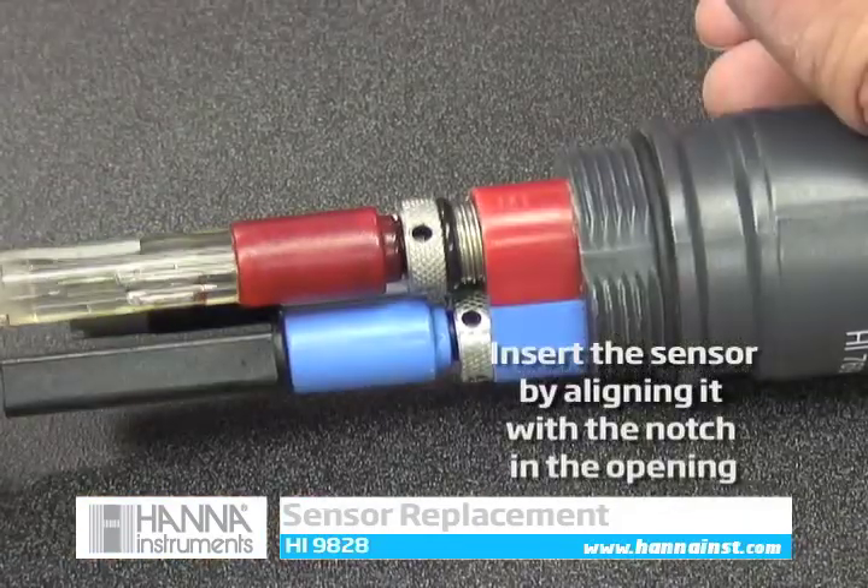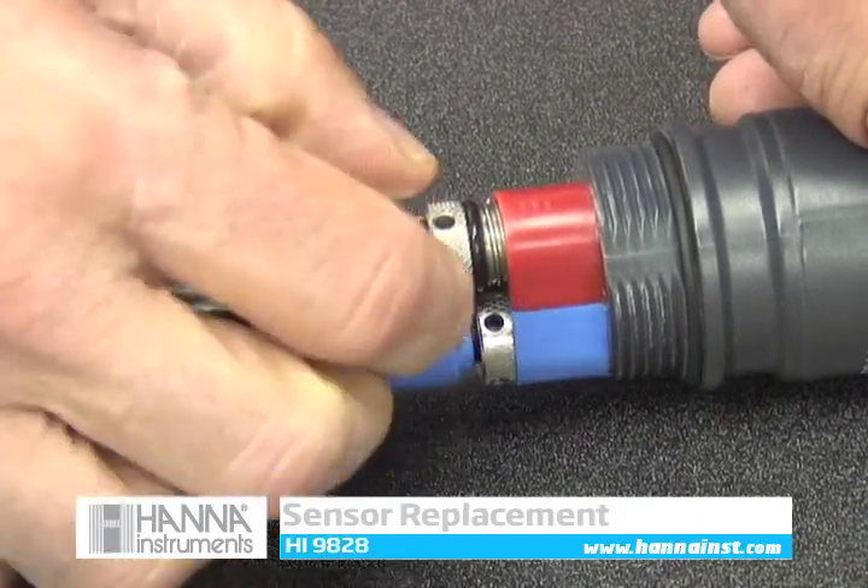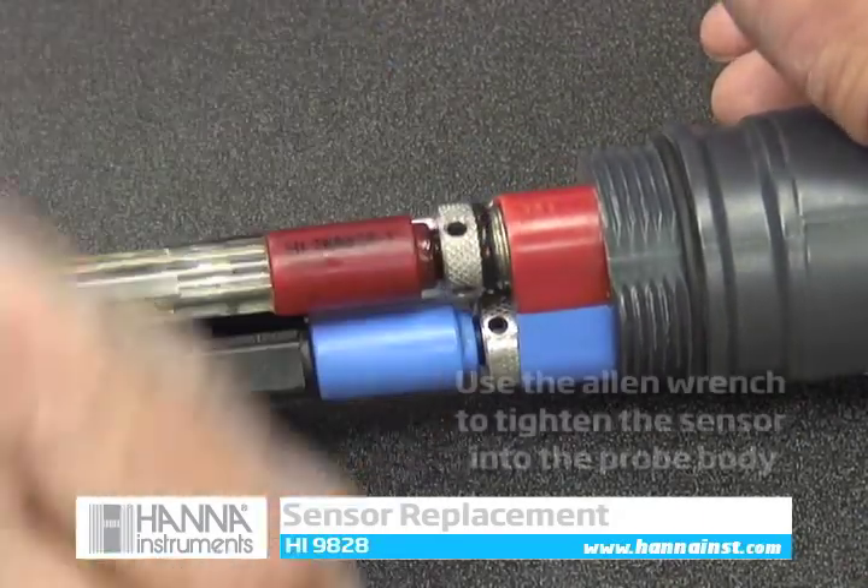Next, insert the sensor into the sonde by aligning the notches and using the supplied allen wrench to tighten the sensor's metal ring to create a secure seal.